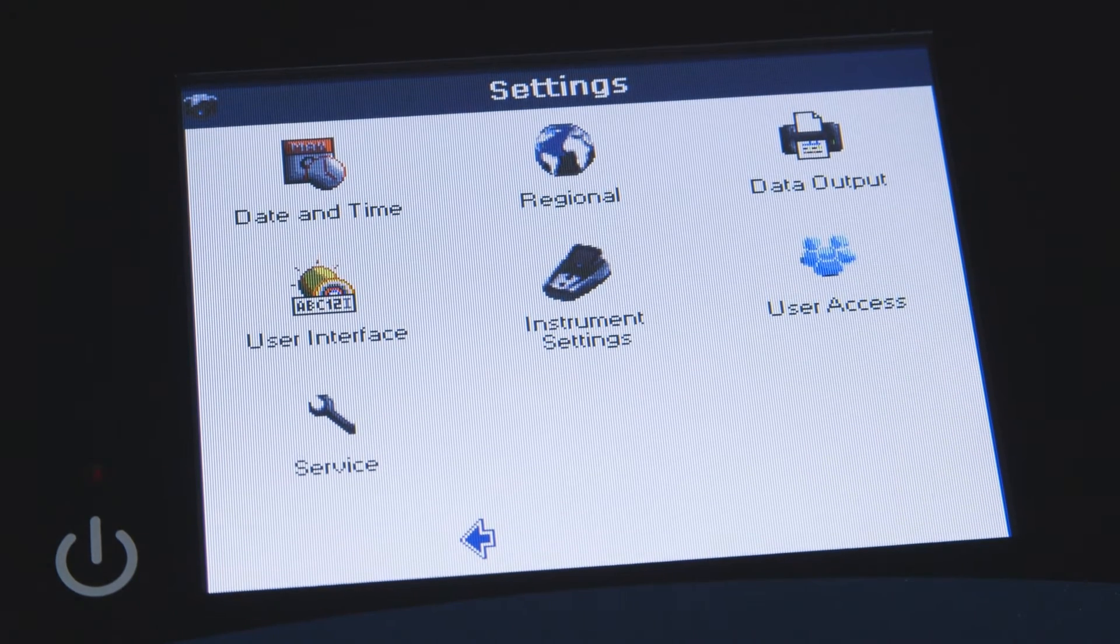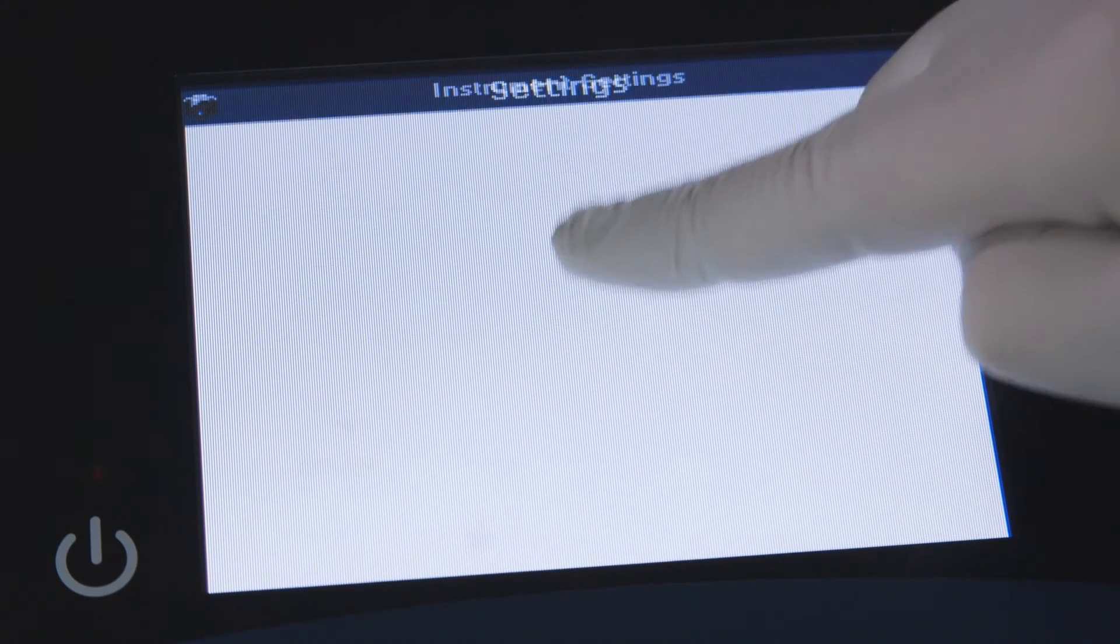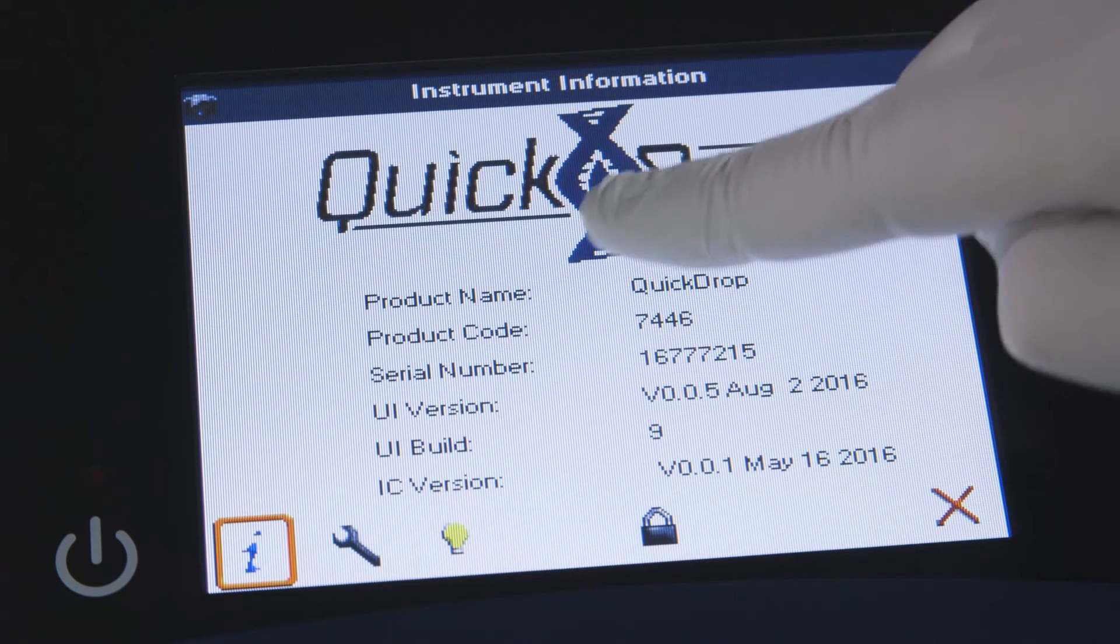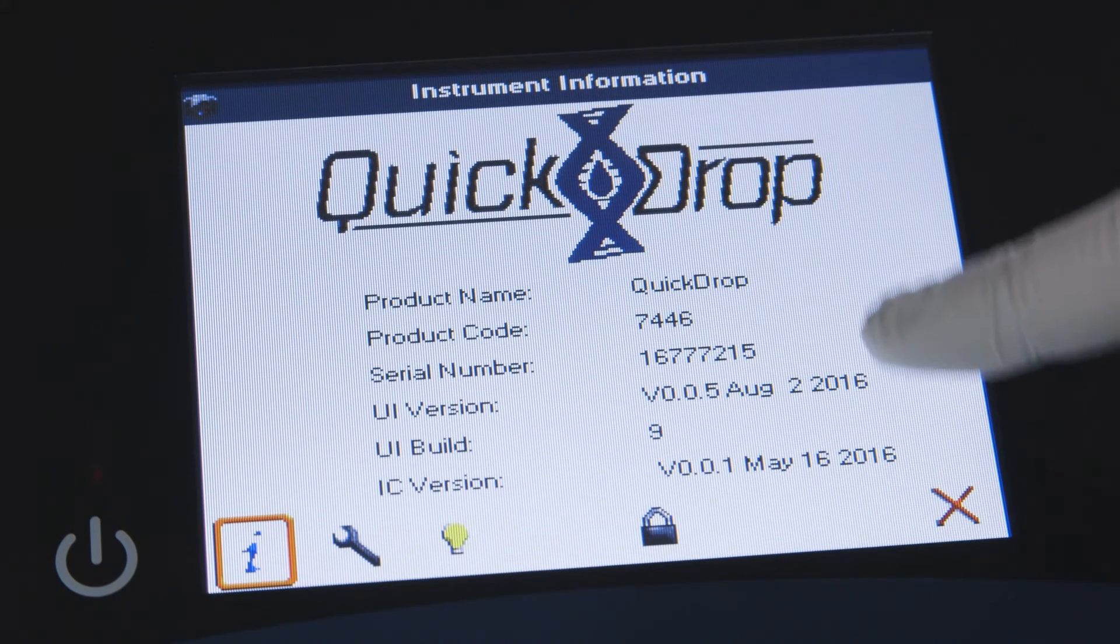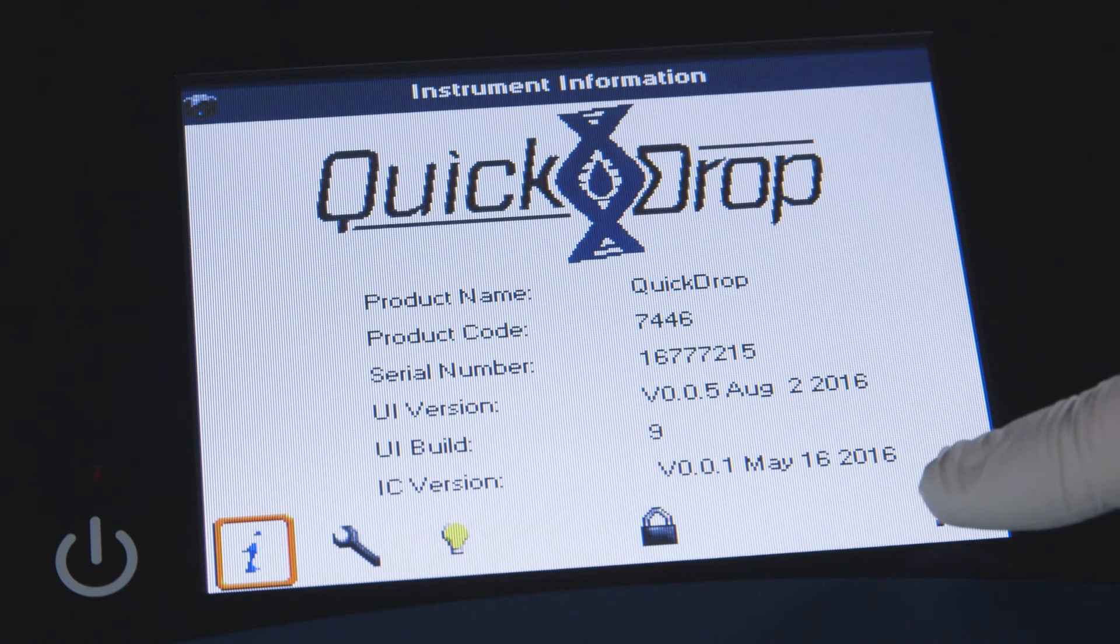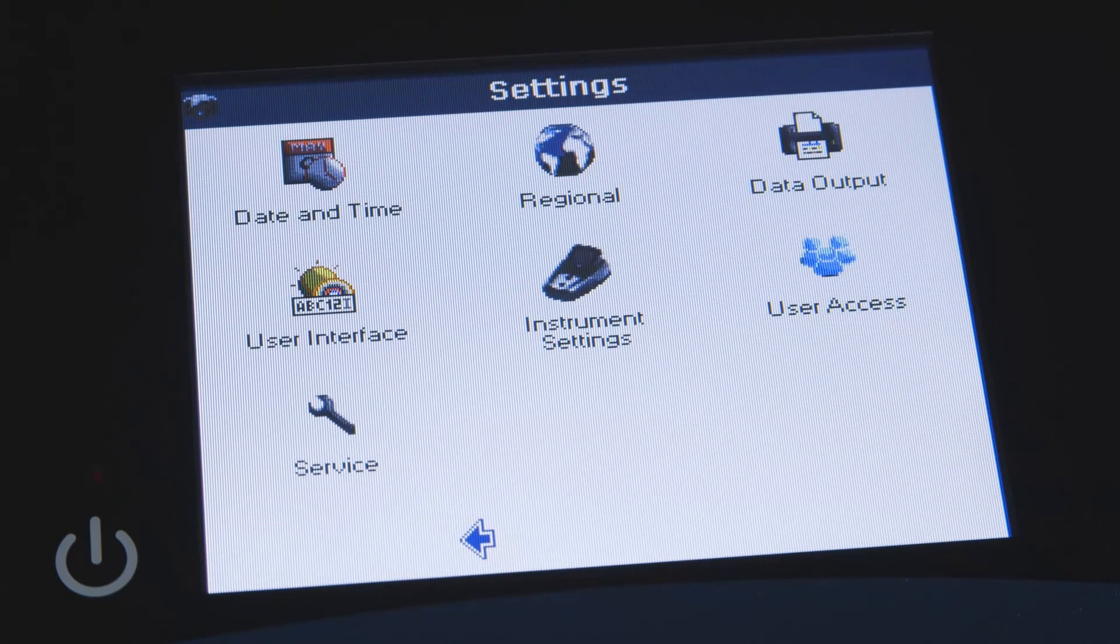In the instrument settings menu option, you may view instrument information and lamp settings.